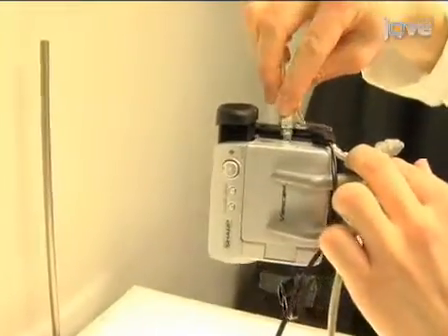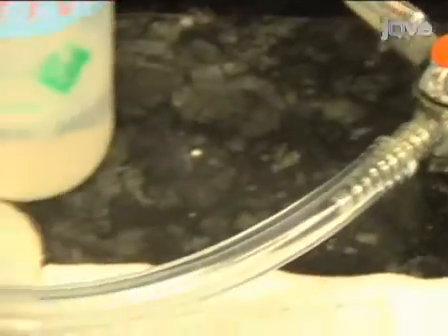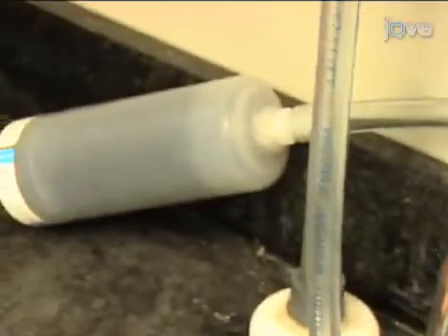Next, using a firewire cable, connect the camera to a computer. We use the software program Windows Movie Maker to record the video directly onto the computer. Since air pulses will be administered in this protocol, an airflow source must be present in the room.